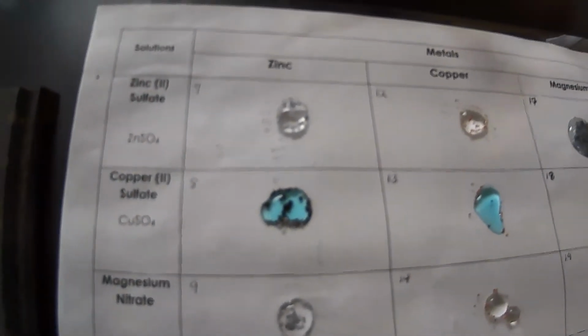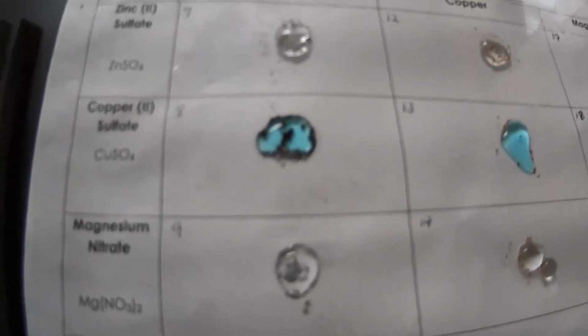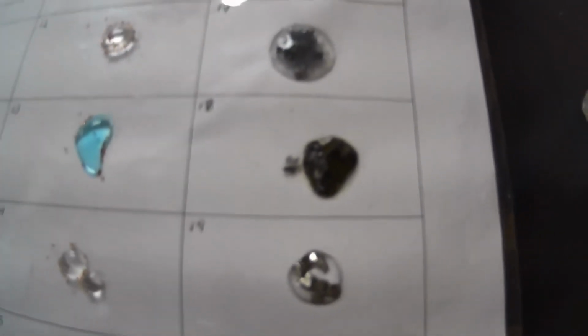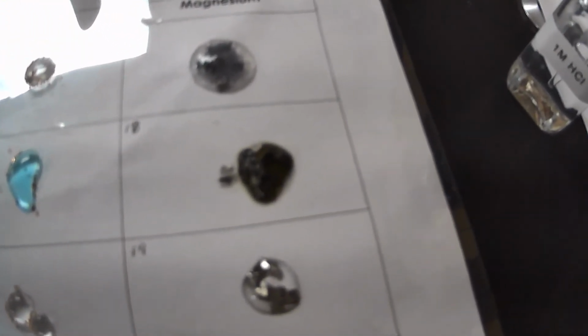Now we have the copper 2 sulfate with the zinc. You can see that looks like dark black. There are a little bit of bubbles there as well. Then we have the copper with the copper 2 sulfate. Nothing is occurring there. And then we can see with the magnesium, if you remember, it was that nice silver-ish color, and now we've got a big pile of black. Okay, a little bit of bubbles there as well.